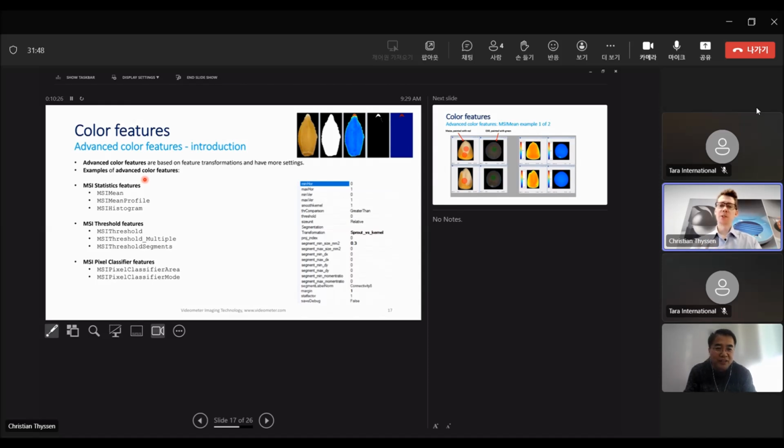I think I understand your question, and correct me if I'm wrong. You make two transformations. The first is to get the grain from the belt, and the second transformation is where you go from here to the third image, where you look only at the seed, you only paint on the seed. Does that answer it? Yes, exactly. After segmentation. Exactly. You do segmentation first, and then you do the other transformation.